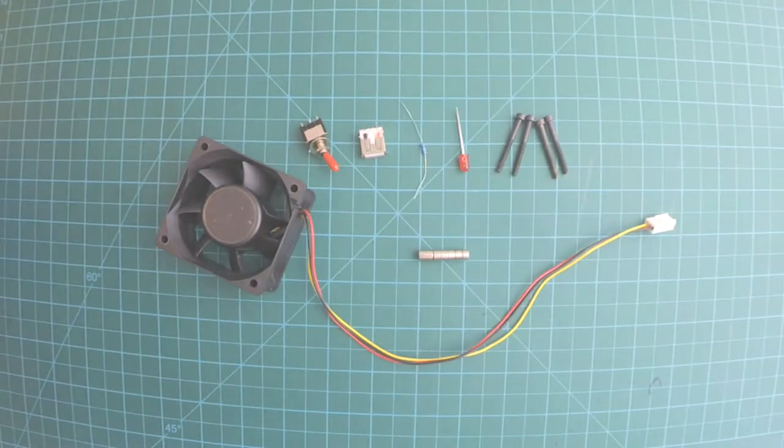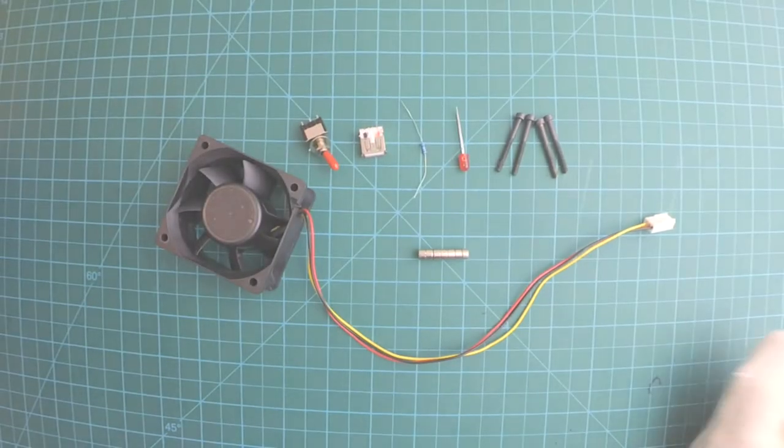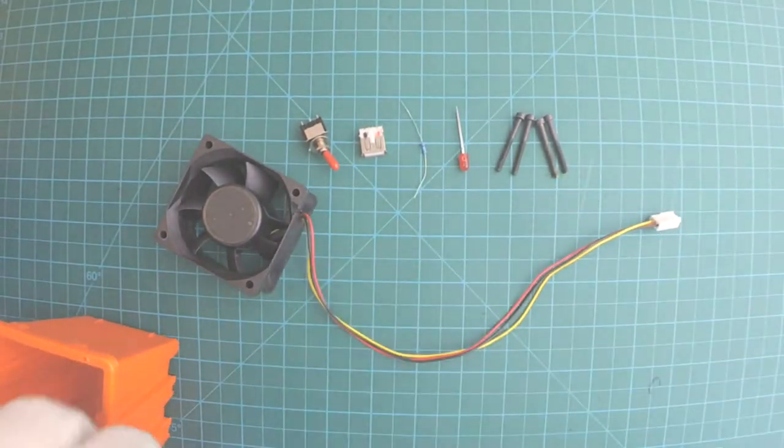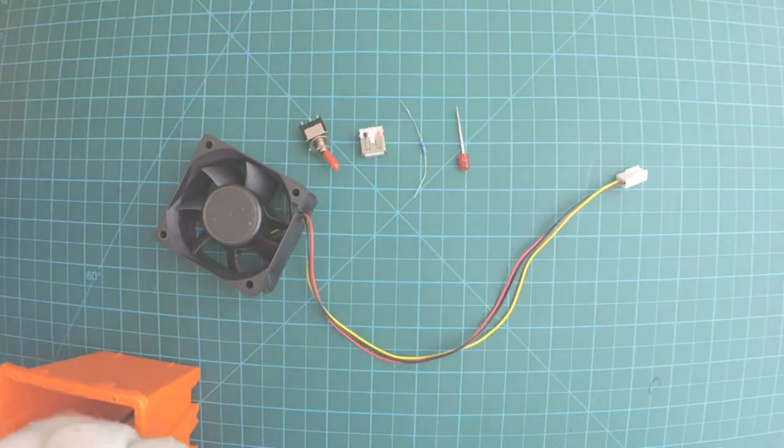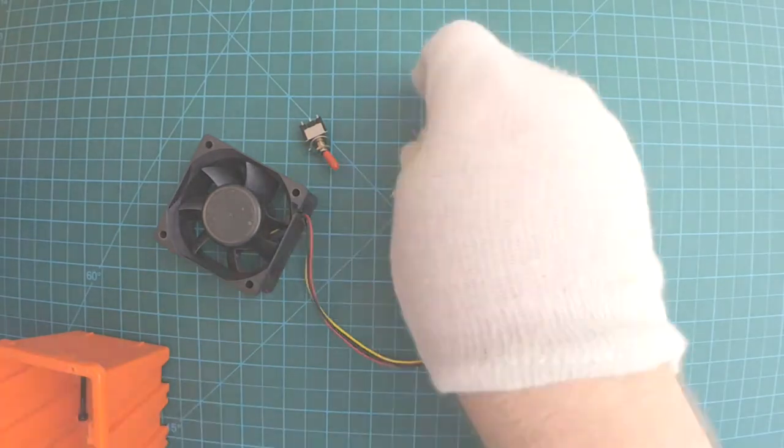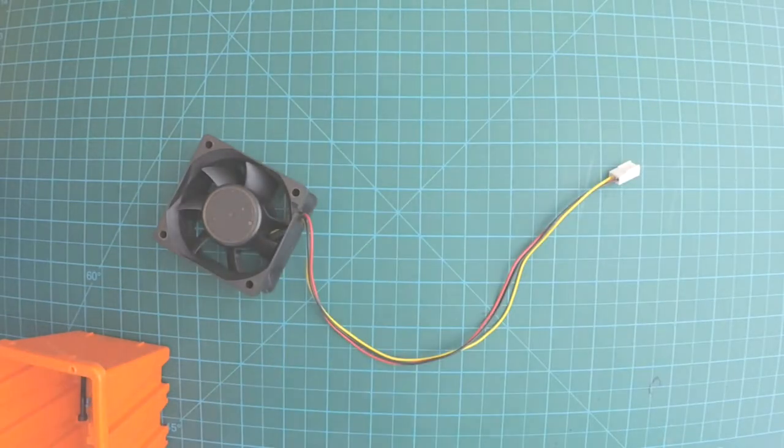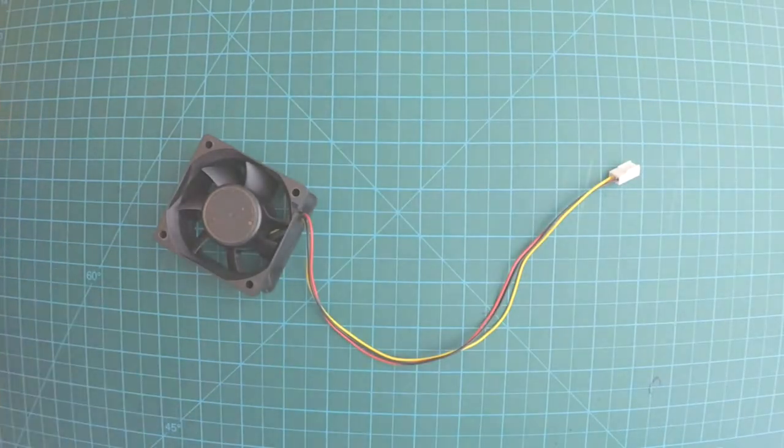I'll use some magnets, screws, an optional LED and its resistor, a USB A type inlet, a switch, and a 60mm fan from trash.